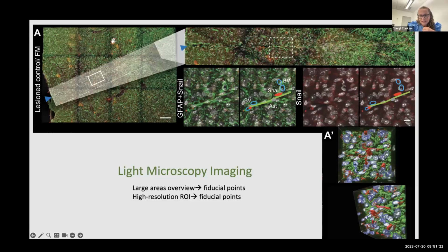And if you can see here what we choose as an area, because I'm targeting these red cells, I have something that is a little bit different. When you have all this ocean of different types of cells in the light microscopy, you feel very confident that you are going to see them, but when you go to the EM, it's going to be very challenging.